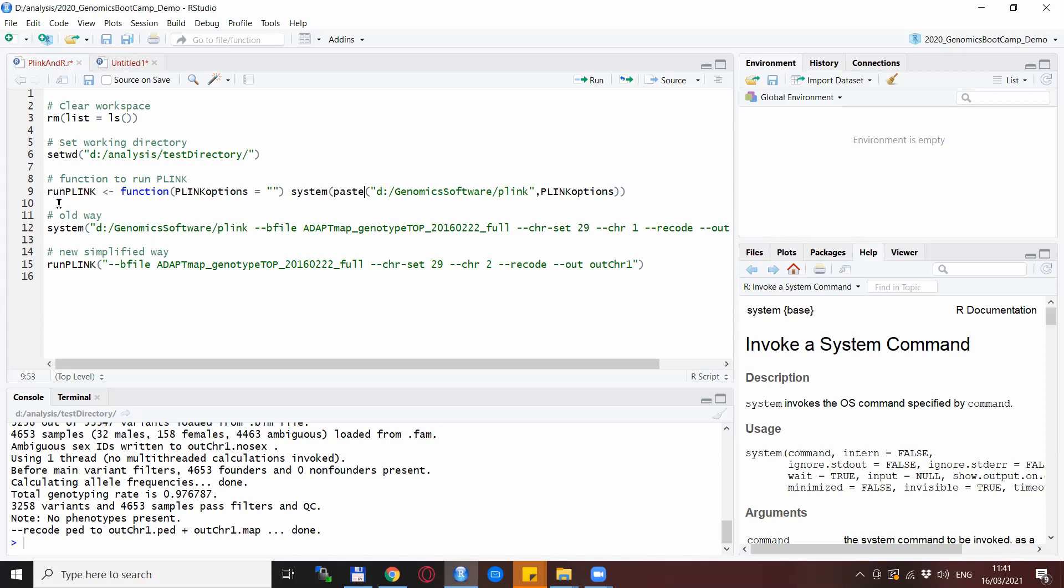So if you don't know about functions too much I will just guide you through this in a quick way. For now all you need to do is just copy and paste this line to the beginning of each of your scripts and you will be basically done with it. But anyway, the function itself has a name. I called it runPlink, but you can call it whatever you want.